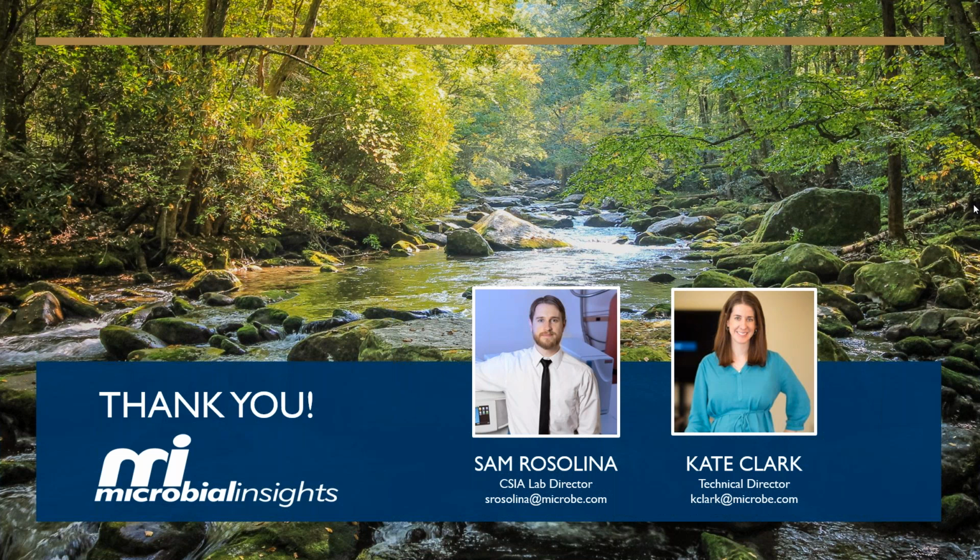And the enrichment factor, it's important to note, doesn't have anything to do with rate. Just because we have a low enrichment factor does not mean that we have a slow degradation process. But what it does mean is that the mechanism by which those bonds are broken is changing in a different way. And so that's essentially what we're analyzing when we look at the modified Kuder plot, or when we look at enrichment factors, is looking at what type of degradation mechanism is occurring.